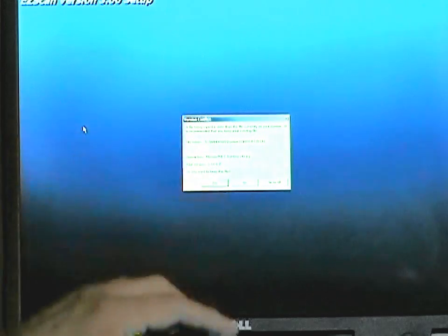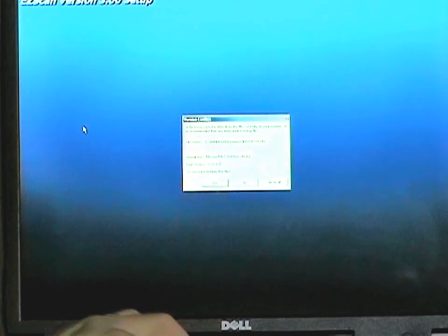Keep the current files or the newer files on your system.